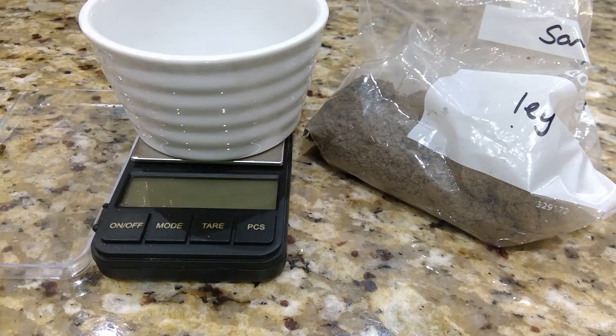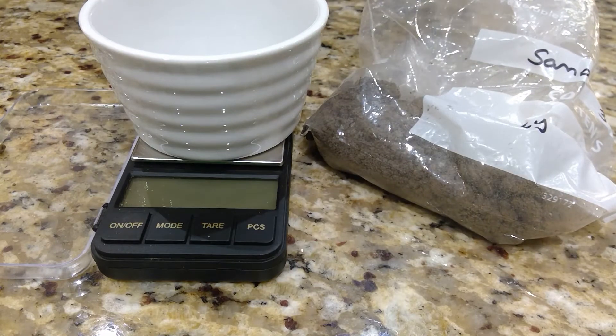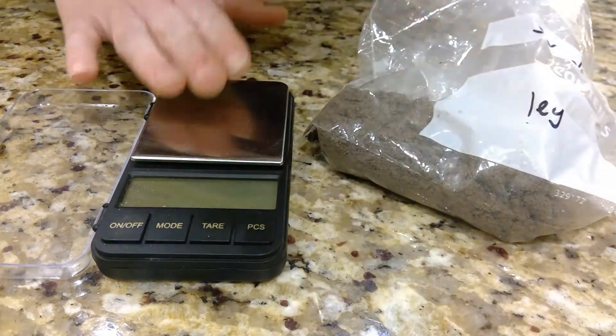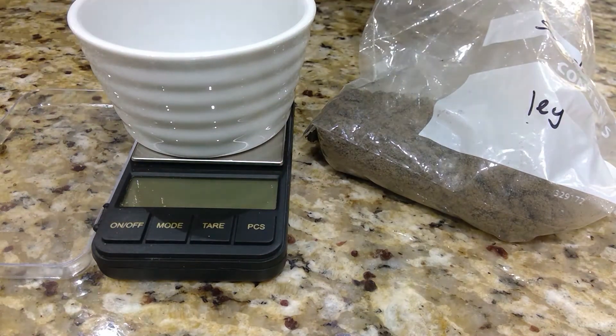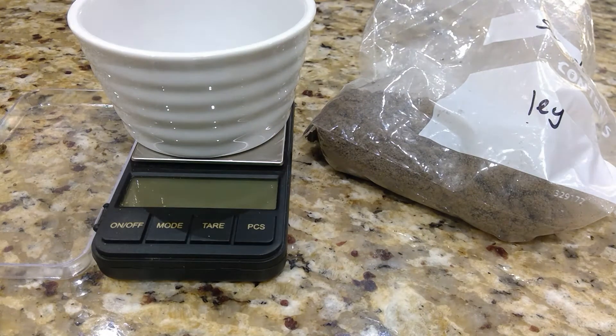Today I'm going to calculate the percentage water content in my sample, which comes from one of our silage fields at home. What you'll need is your sample, a weighing container, a set of scales, and I like to use a foil tray.